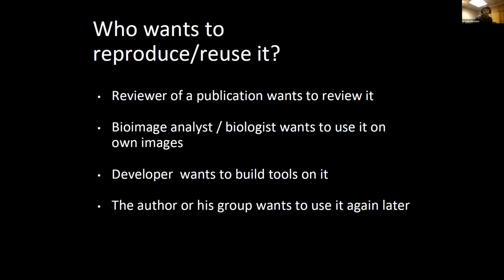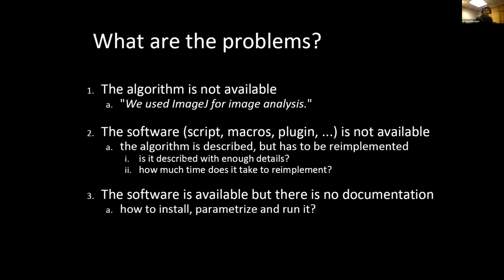Also, the bioimage analysts and biologists that want to use those workflows on their own images. Also, developers that build tools, and yourself or other people who want to reuse your workflow. They want obviously to be able to obtain relevant results from them. So what can go wrong when you try to reuse a tool?